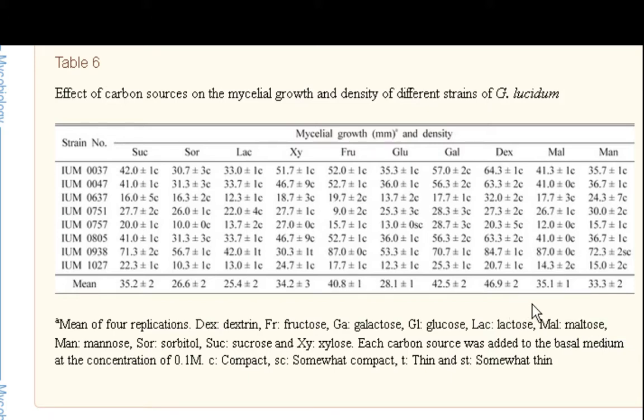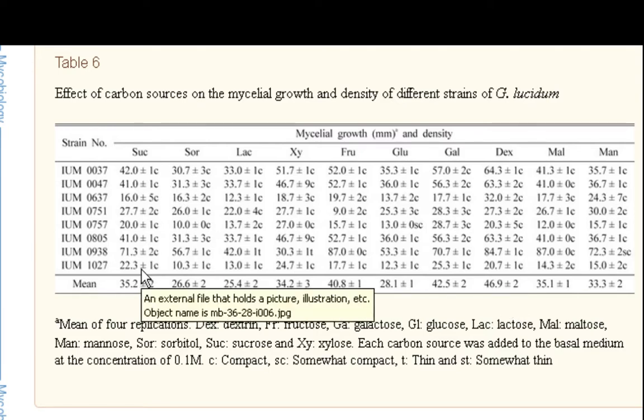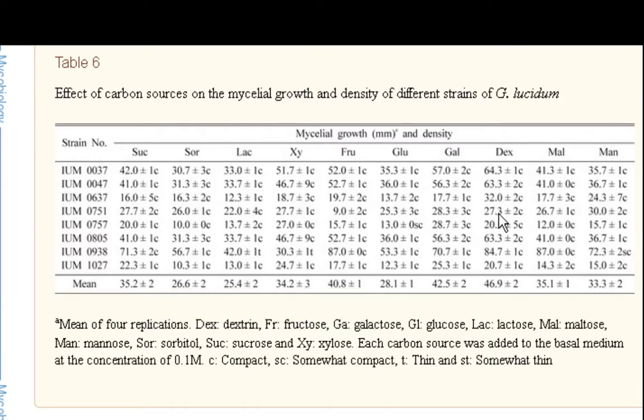So that's why I think potato dextrose is going to make a really good base, but I don't have the corn sugar. I can't find it. All I can find is the sucrose. If I substitute the sucrose for the corn sugar, since I already have the potato dextrose, and there is glucose or dextrose in this sucrose table sugar, my amounts are going to be comparable.